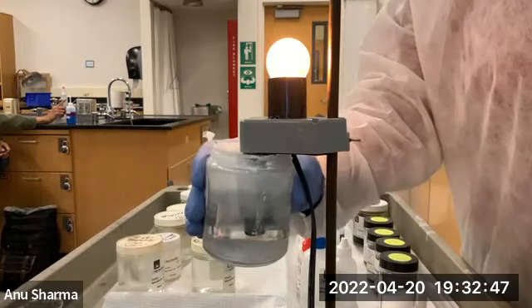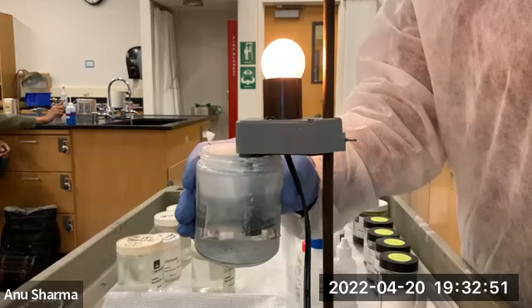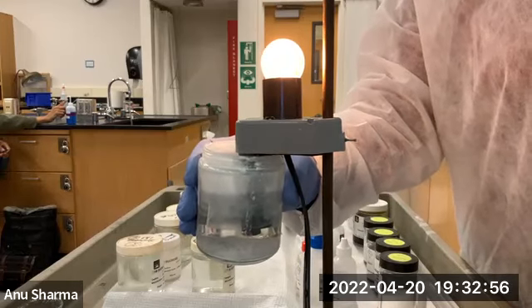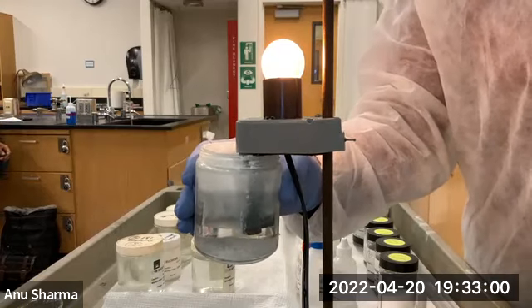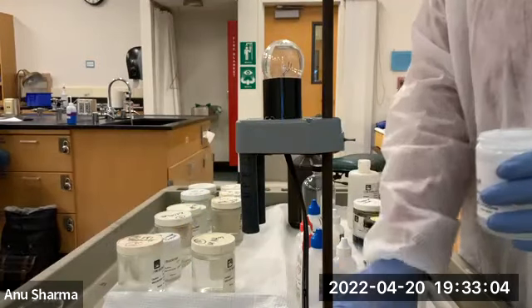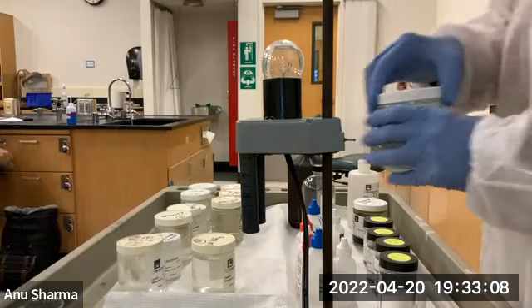I wouldn't say it's a very strong electrolyte, but it's not a weak electrolyte either. So it's kind of in between. What you see here is a strong electrolyte, so you guys can put it as a strong electrolyte. Yes, it is ionizing, giving you lots of barium ions and lots of hydroxide ions.